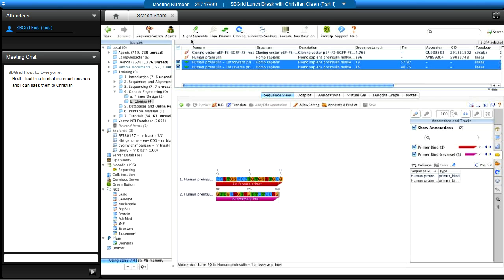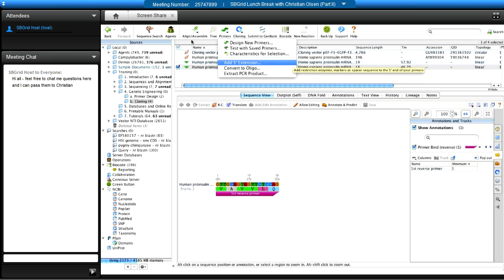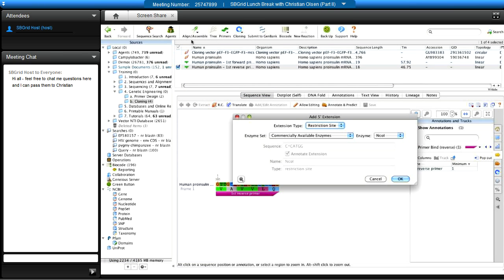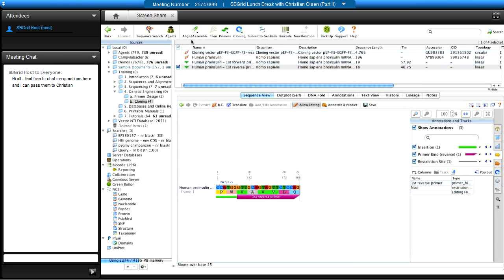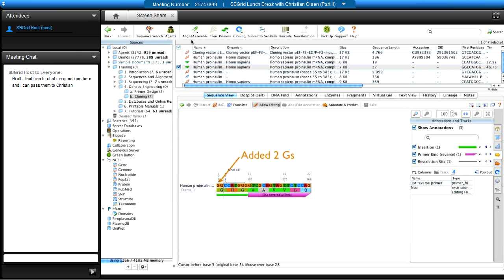The next step is adding a five-prime extension. Double-click the primer or go to the primers menu and select 'Add Five Prime Extension.' Choose 'Restriction Site' as the extension type and select the NcoI enzyme. The primer expands with a green fluorescent box showing the extension. You can also add nucleotides — for example, extra G's to help improve cutting efficiency — by clicking 'Allow Editing' and typing in the nucleotides.